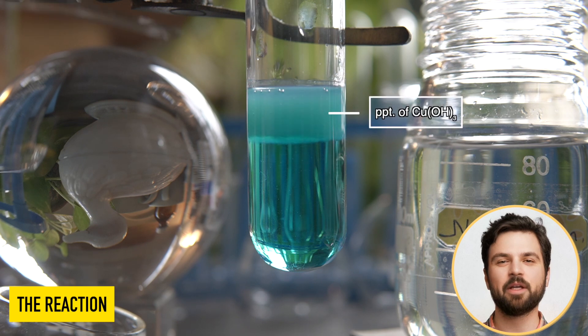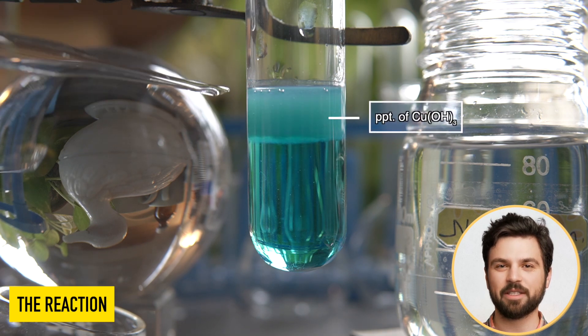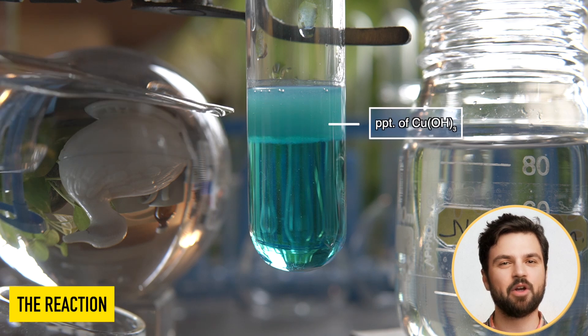The insoluble blue precipitate that has been formed inside the test tube is nothing but copper hydroxide.